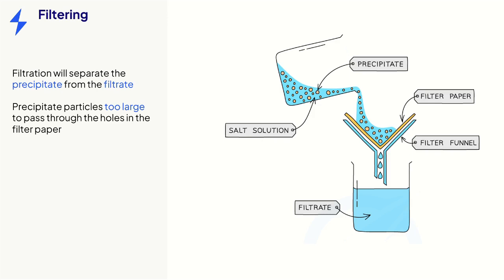A funnel and filter paper are used for this, so if you are asked to draw this in an exam, make sure you draw and clearly label both the funnel and the paper.